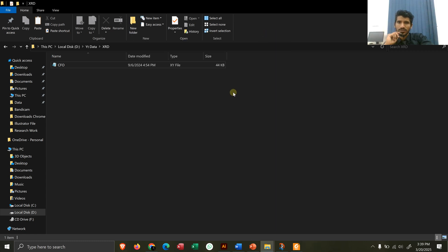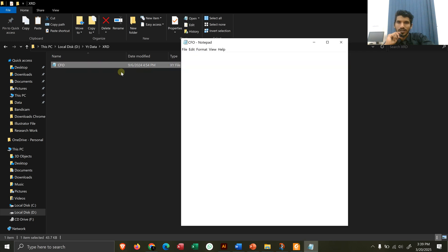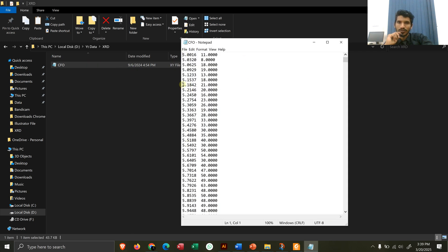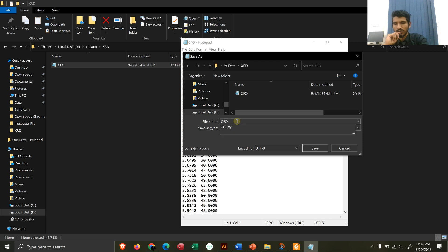The topic of today's video lecture is how you can use HighScore Plus to find your product using your XRD. Here is your XRD file — you can open it, and when you open it you can see you have the two-theta column and the intensity column. The next step is to perform Save As (Ctrl+Shift+S), click 'All Files', and at the end of the filename write '.asc' — that is the extension for HighScore Plus.